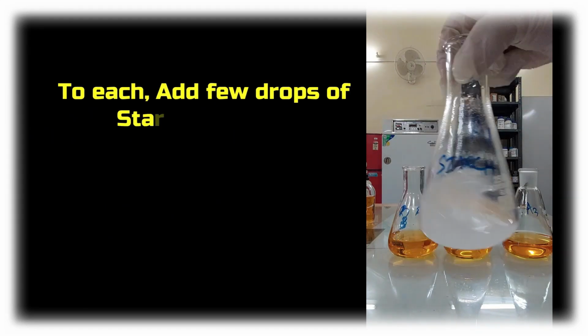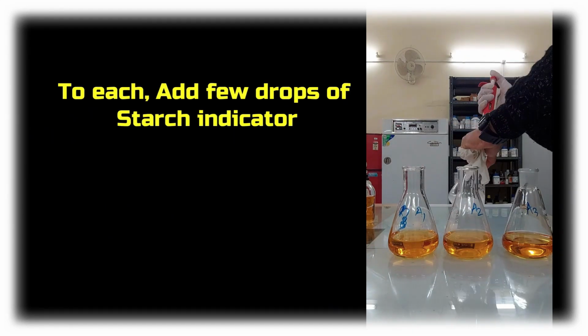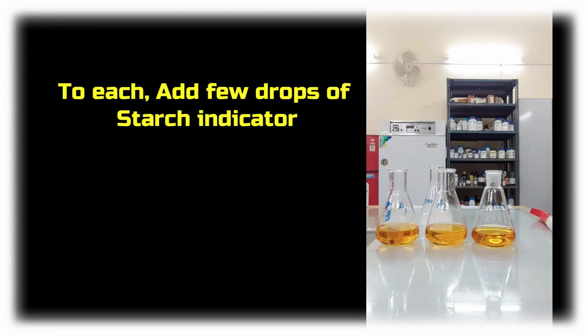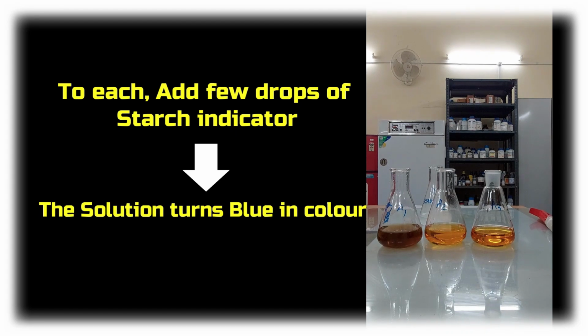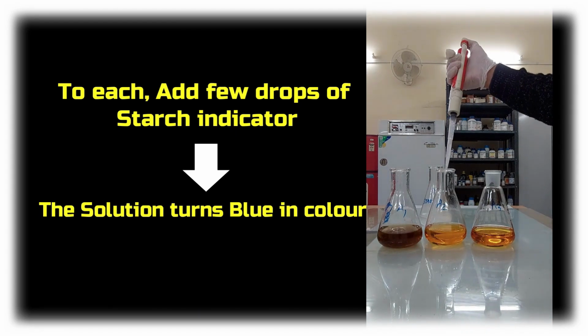And then to each sample add a few drops of starch indicator. Stir the solution and you'll see that the solution turns blue or dark blue in color.